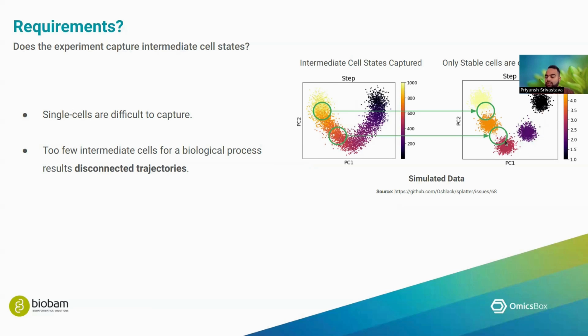Because if you run trajectory inference algorithms on these kinds of data sets, in the default settings most of the methods will try to learn disconnected trajectories over this data set. But if this represents a single biological process, for example, if this is coming from a single sample or a single snapshot of the biological process, then it might confound your analysis.